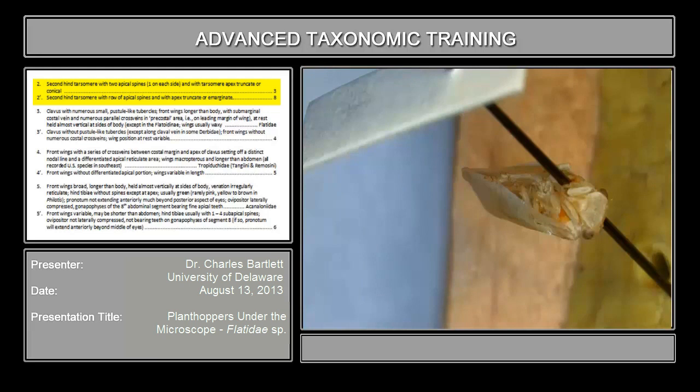Having discovered that the second hind tarsomere has two apical spines, we go on to couplet three. That division — whether the second tarsomere of the hind leg has a row or a pair of apical spines — is an important conceptual subdivision between groups of planthoppers. It divides them roughly in half: the basal or primitive planthoppers have a row, and all the advanced planthoppers have the spination of the second tarsomere reduced. Getting in the right group makes it much easier to proceed.